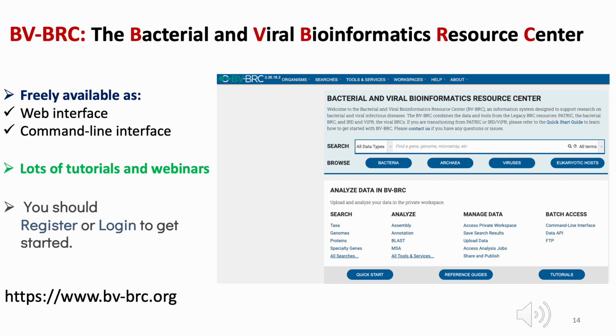It's freely available and you can upload your private data in a workspace, analyze it using high throughput services, and compare it with the other public databases using visual analytical tools.